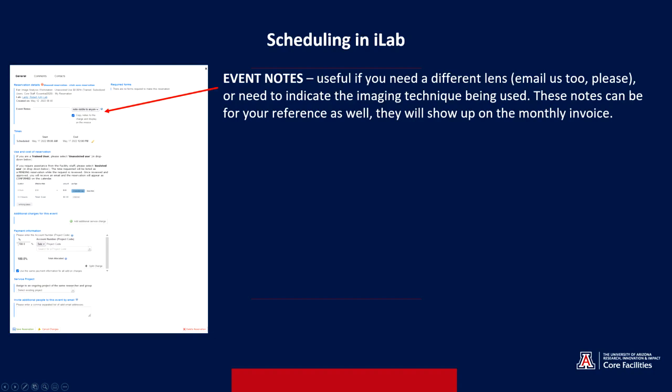For those of you that might want a different lens to be mounted on a microscope, we can do that. We prefer that you email us directly, but it can be done in the form as well. Please understand that switching lenses on microscopes is not something that's easy to do, and that there are other users and we can't be switching lenses 2 or 3 times a day. So we may need to coordinate that.